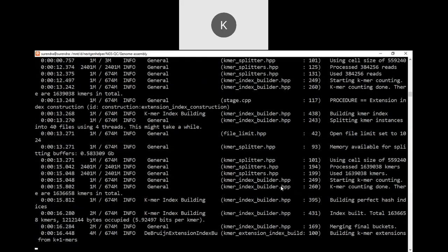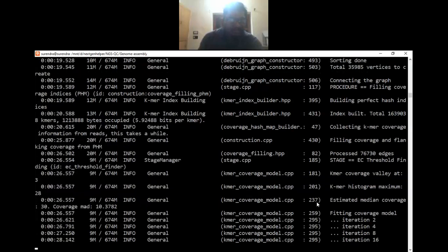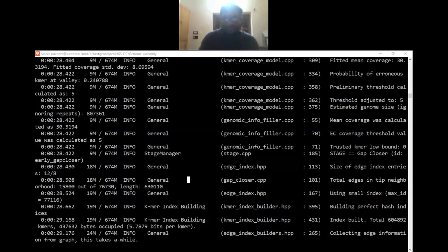Yes, that is the most important thing we want to do actually. The first thing you can do is go for Nanopore or PacBio sequencing to fill the gaps. We have a financial crunch, we can't perform both Nanopore and PacBio. We have funds for Illumina only. No, it won't cost you too much, I think. You can look into the prices. Is it a prokaryotic genome? Yes, a bacterial one. So just look for the costs, and I think it will help you. It won't be very expensive.